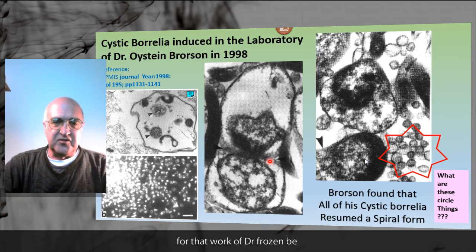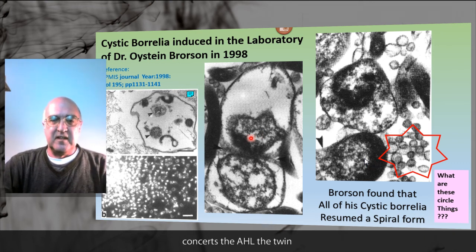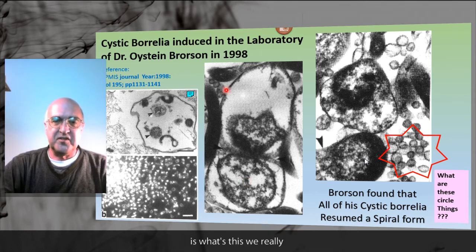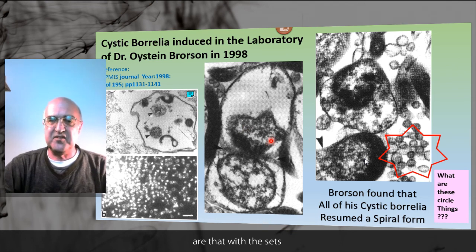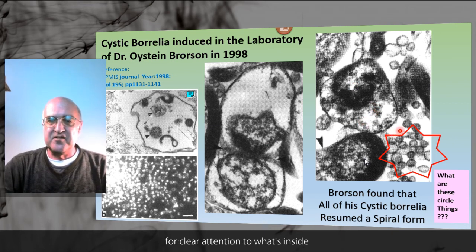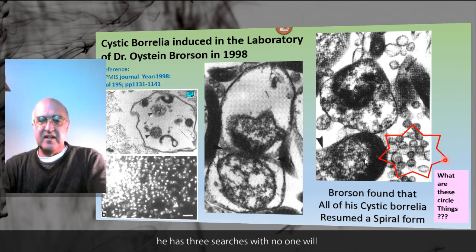From the work of Dr. Brorson, we see that the cystic forms may have little content or may have dense content within the structure of the cyst. The darkly staining structures may look like degenerating cells. Here's one cyst with dark content within the cyst. Here's another cyst with dark content and with smaller granular forms. I call your attention to what's inside the red star area — these are mystery structures right now, but we'll find out what they are.